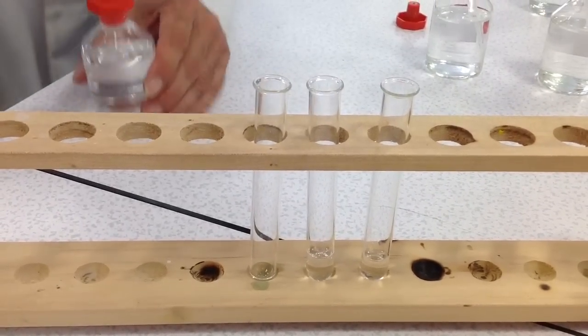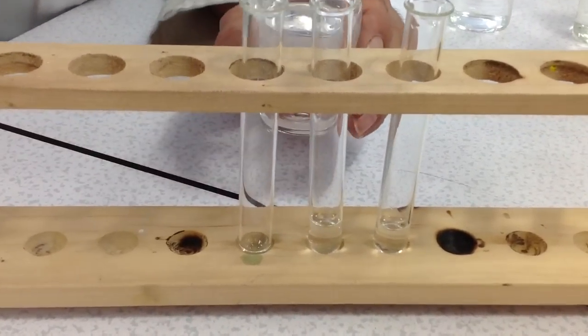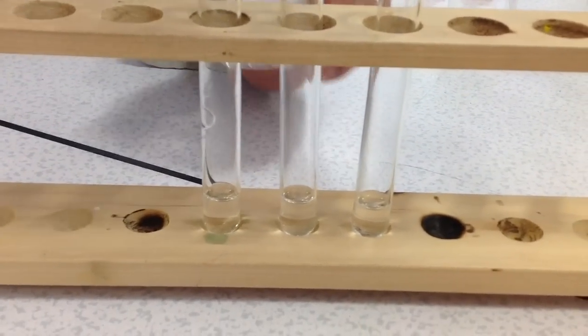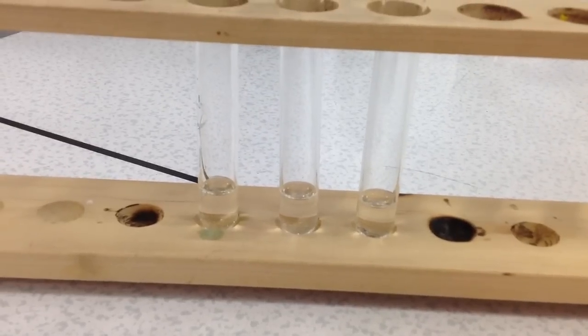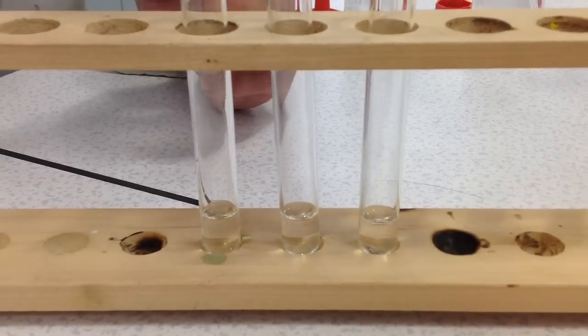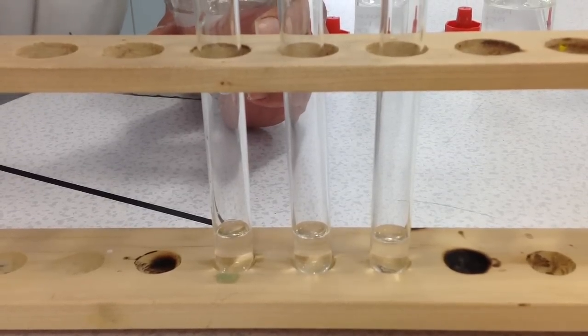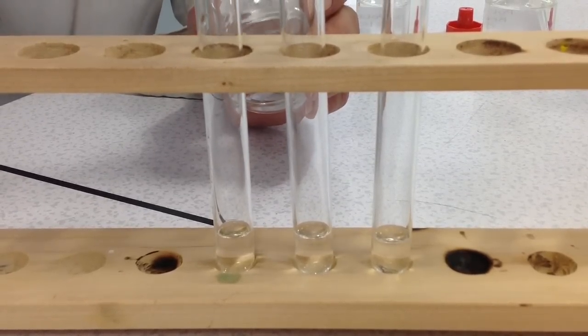And the final tube, I'm going to add some potassium iodide. Now to each of these 3 tubes I will add a small quantity of silver nitrate. And we should see 3 different colours of precipitate forming.